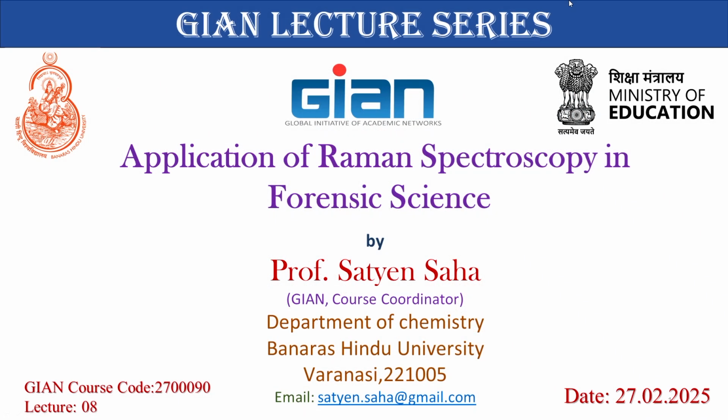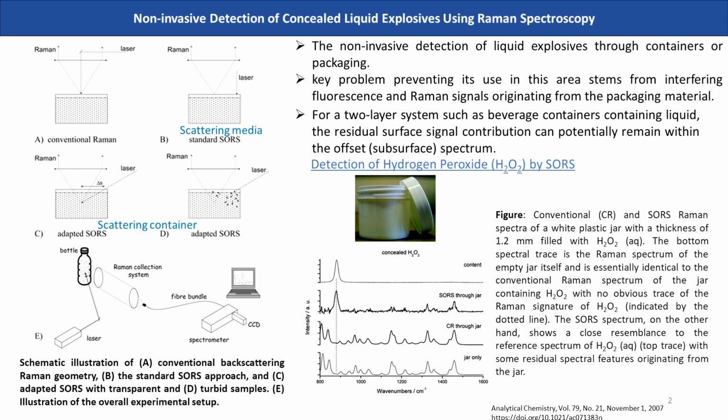So, welcome to this lecture. This is an application-oriented lecture, on the application of Raman spectroscopy in forensic science. In the last class, I talked about the application of Raman spectroscopy in the medicinal field, and today we will be talking about forensic science. So there is a word here, non-invasive detection.